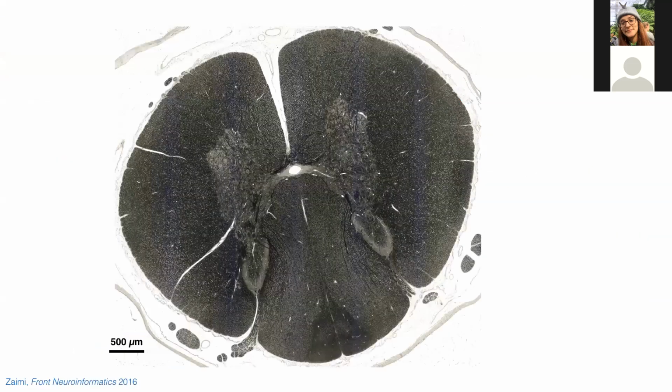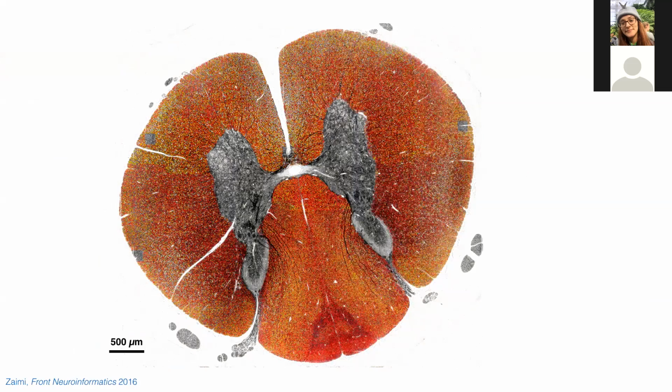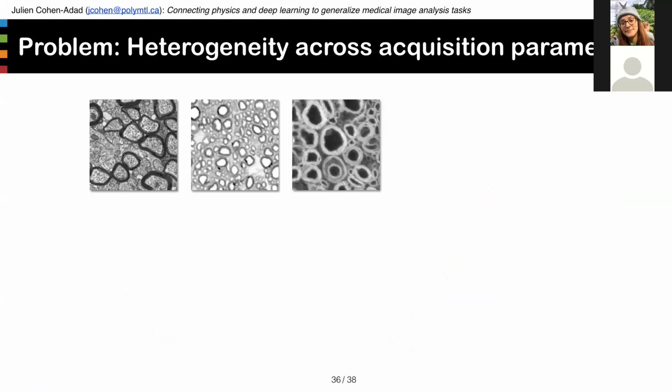And when we apply that to large-scale images, the code can handle multi-patch data, overlapped windows, and so on. And then it can basically save a lot of time for the poor grad students who previously had to manually label all those axons and myelin. And from that kind of output, we can really quantify useful values to compare with MRI. But we face, again, the same problem as with MRI.